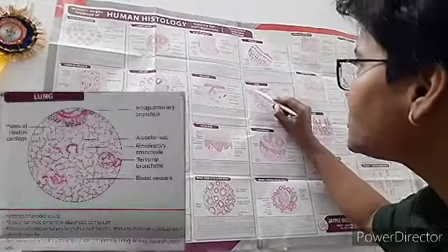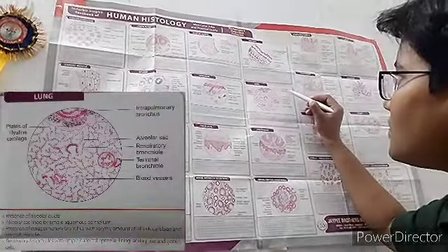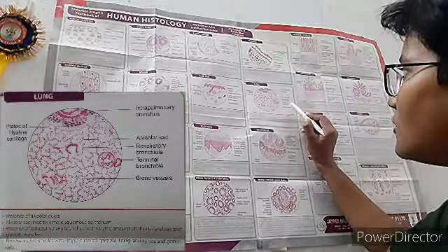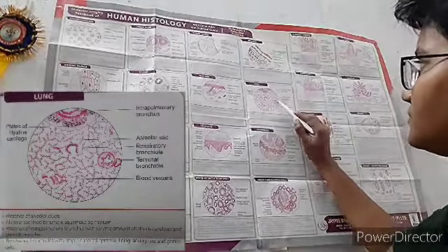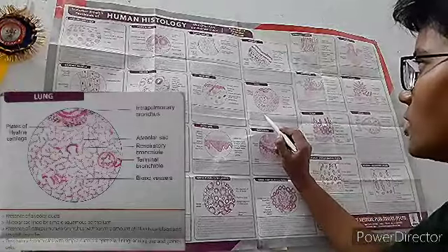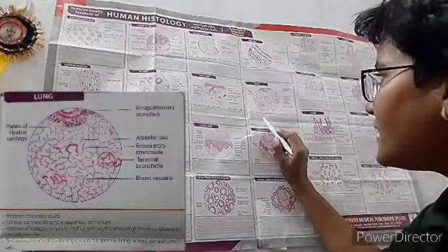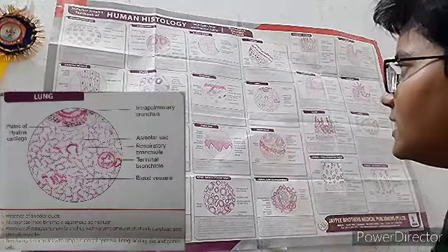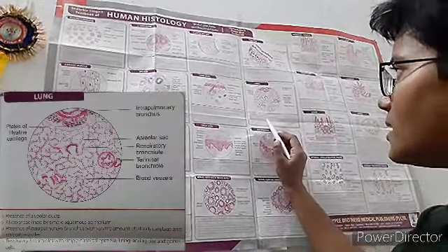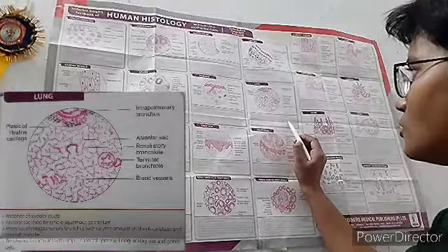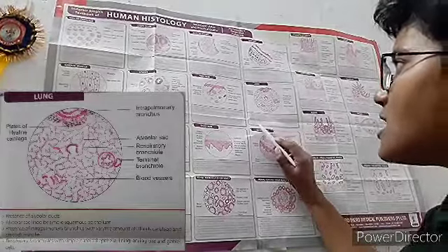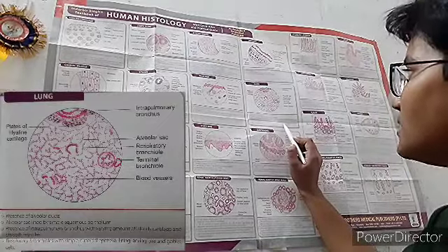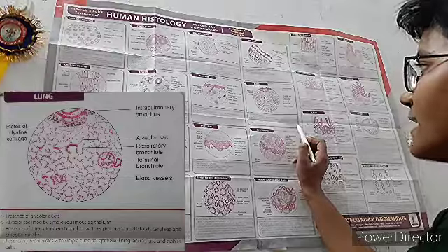Now the lung. Visible structures include plates of hyaline cartilage, intrapulmonary bronchus, alveolar sac, respiratory bronchioles, terminal bronchioles, and blood vessels. The lung shows alveolar ducts and alveolar sacs lined by simple squamous epithelium. The intrapulmonary bronchus contains a varying amount of hyaline cartilage and smooth muscle. Respiratory bronchioles are lined by simple cuboidal epithelium, lacking cilia and goblet cells.